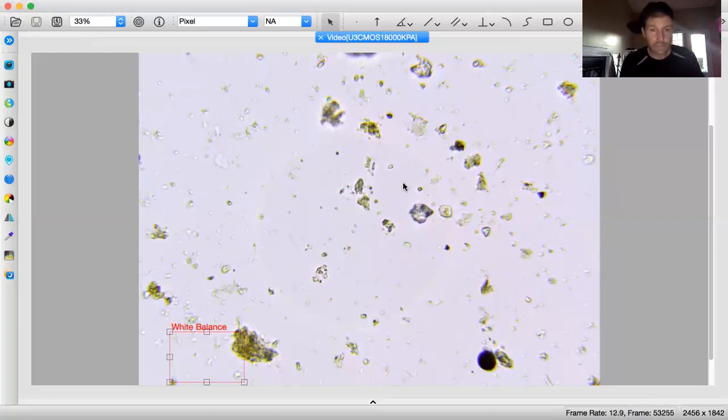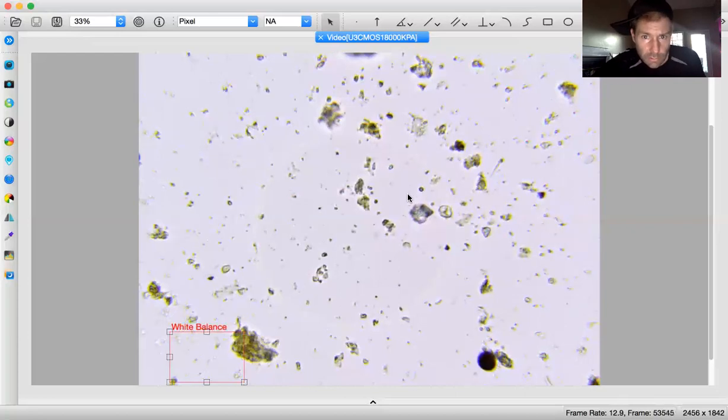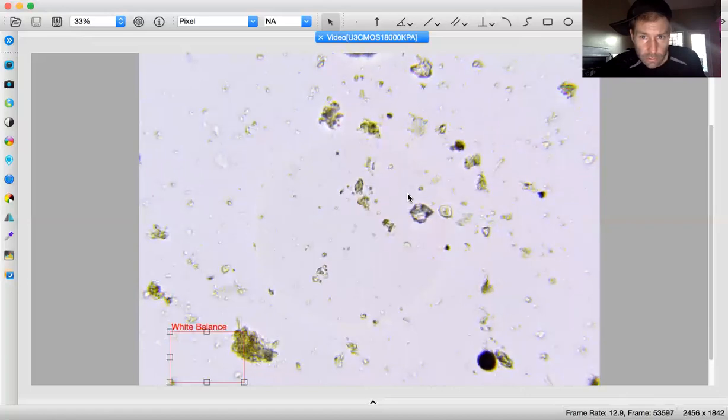It's a lot of flagellates in this, man. Some good compost. Gotta give those guys props. Oh, is that another one? Or is that the one I just recorded? Yeah, I don't see another one, so I'm gonna go with that. He must have jumped a little bit from when I saw him last. And just go to the top of the frame and back down again to make sure. Nothing up there. Nothing down there.